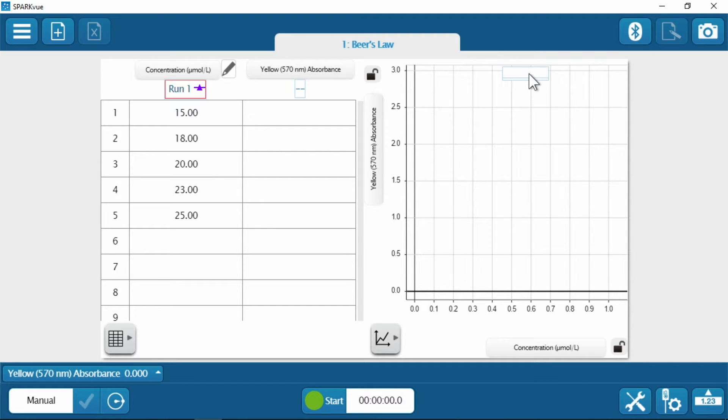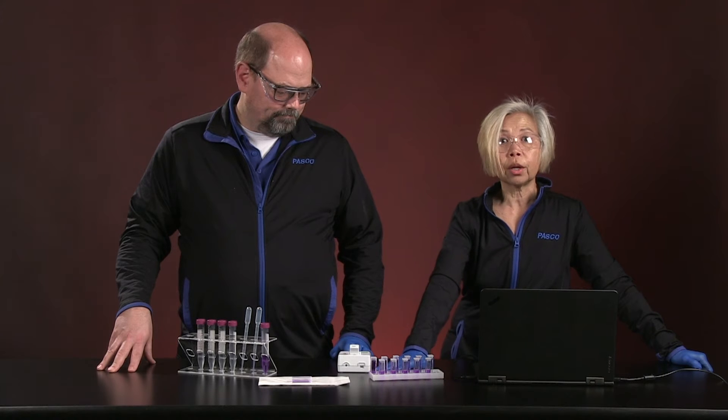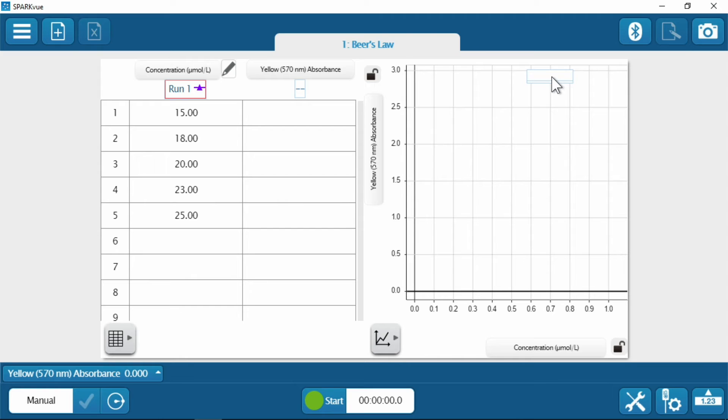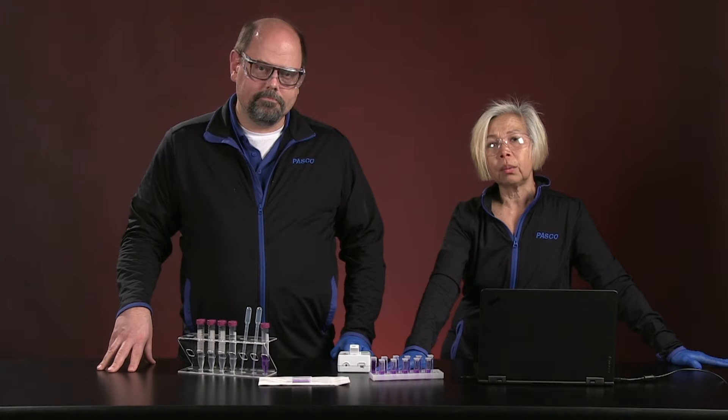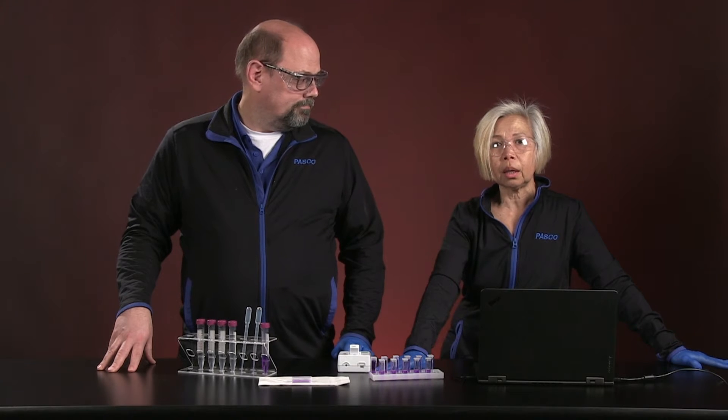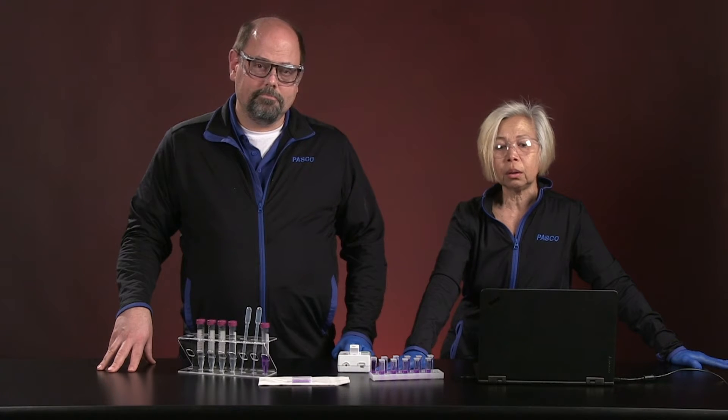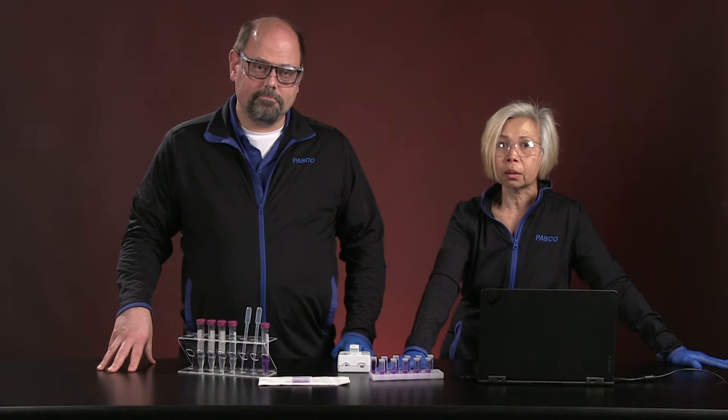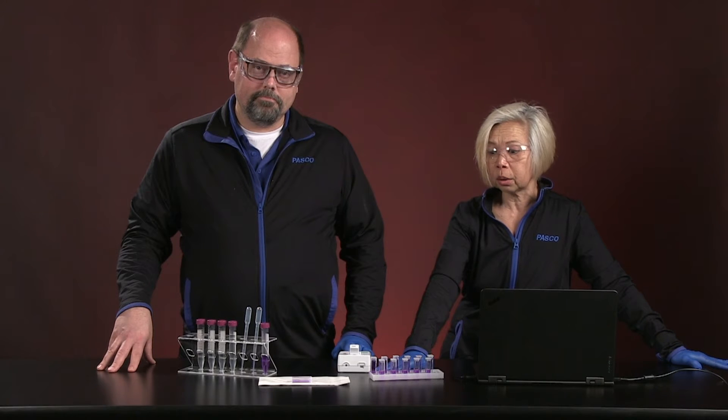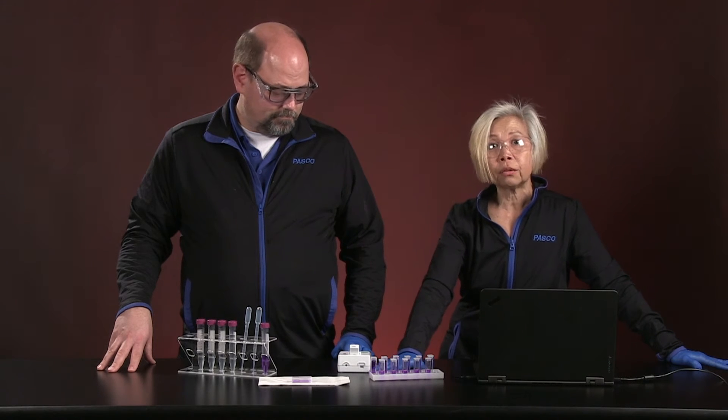I have actually set up a configuration file to do this study. So I have five concentrations of crystal violet, 15, 18, 20, 23, and 25 micromolar. And you're probably asking the question, wait a minute, we are going to be doing kinetics. We are not looking for an unknown. Why are we setting up a Beer's Law calibration curve?